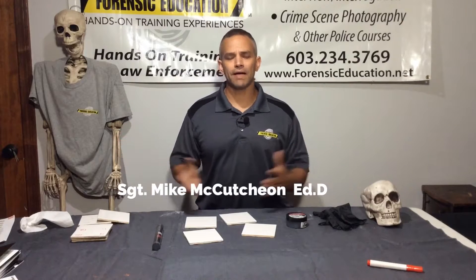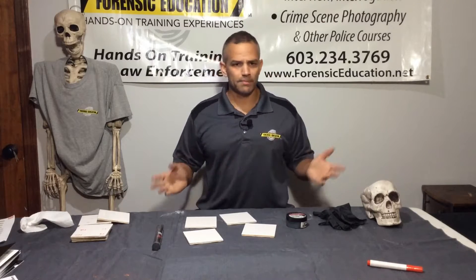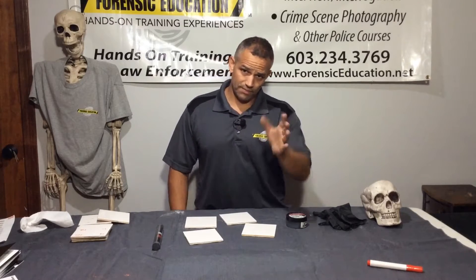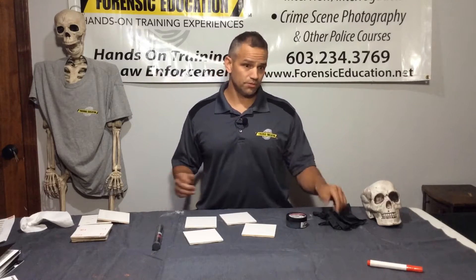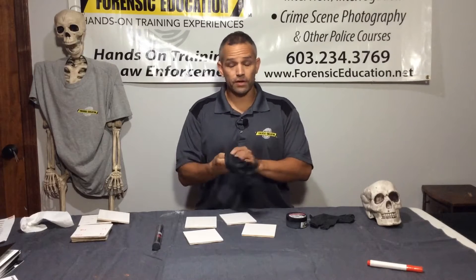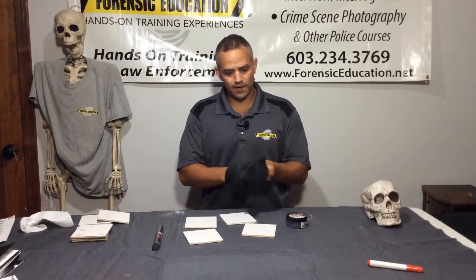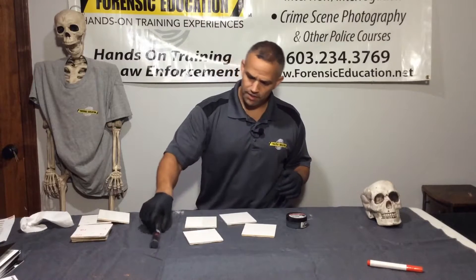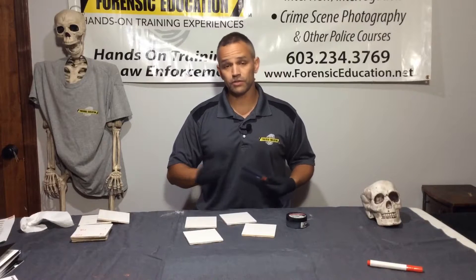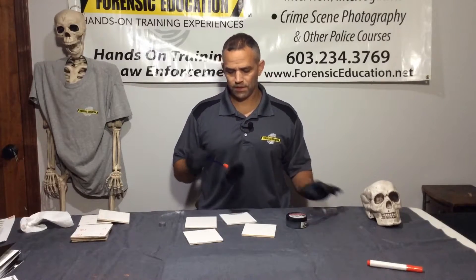Hey everyone, I'm back. I'm Mike McCutcheon with Forensic Education, and I'm just going to do a quick demonstration today of some of the problems that you have when you're fingerprinting — some things that you mess up. The first is not wearing gloves and then your hands get all nasty, so I'm going to put my gloves on. I threw a couple of prints on these and I'm going to show you some of the wrong ways to process a fingerprint.